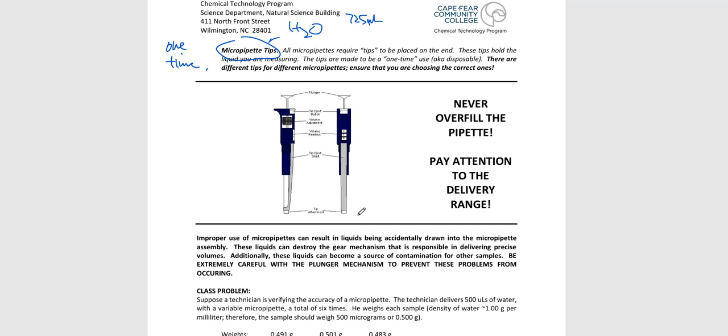The problem in a real lab, though, is that we would switch them and trash them, because we are always worried about contamination. Contamination can be an issue. If I am contaminating my sample, where is it coming from? How can we minimize that contamination? That is something I'm always having to worry about and talk about. That is the piece we need to make sure we take care of, and that is why we throw these tips away. Contamination can be a bad thing if it's not contained. All right, so contamination, blah, blah, blah. Look at my Dr. Scribble.